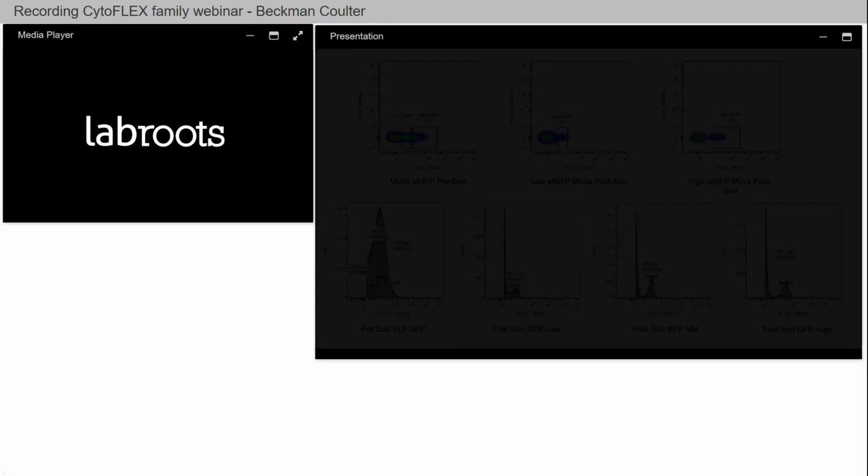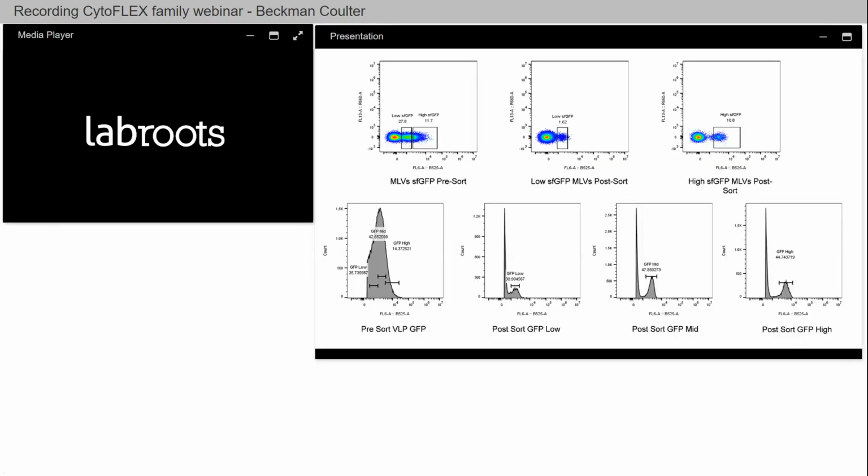So as we go into the next one, first thing I want to point out is these gates are arbitrary. There was really no predefined notion of where they should be. We just arbitrarily picked these spots and decided, could we separate when we had this kind of heterogeneous push of fluorescence, right? There's not well-defined aspects here.